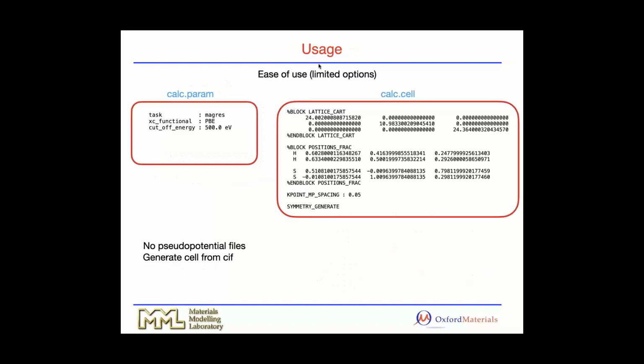Okay. Just to note that the number of input parameters for something like an NMR chemical shielding calculation is really very low. Now, you may well be running these through Materials Studio, but just to highlight what's under the hood, CASTEP would take 2 different input files, a cell and a param file, and this would be a minimum input in order to run an NMR calculation.